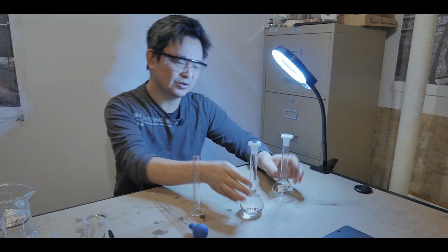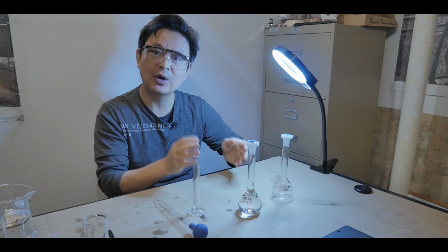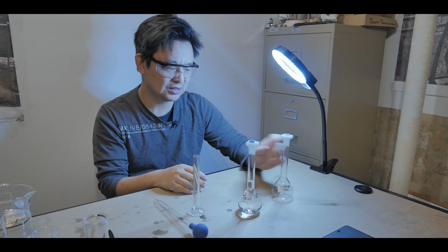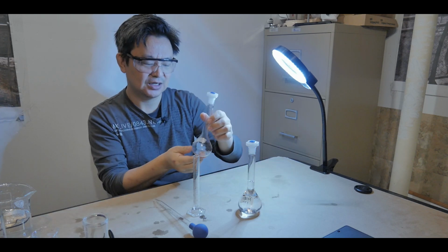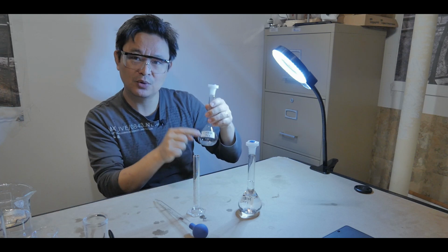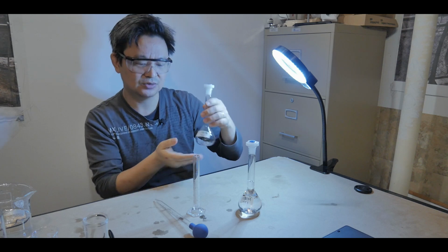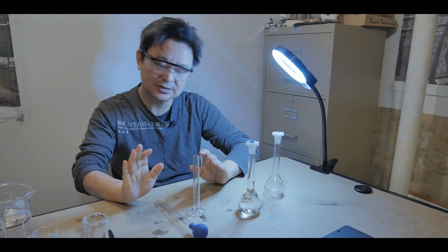And then what you want to do, let's say you have 1 molar concentration and you want to make 0.1 molar concentration. So here I have another volumetric flask and I will label it. I'm going to make 0.100 molar concentration. Now there's 2 ways to do this.